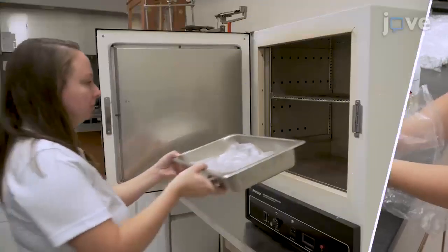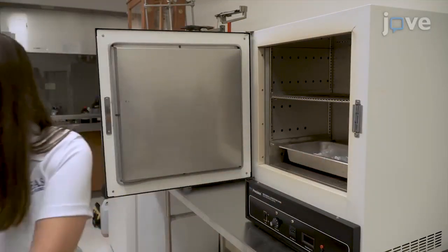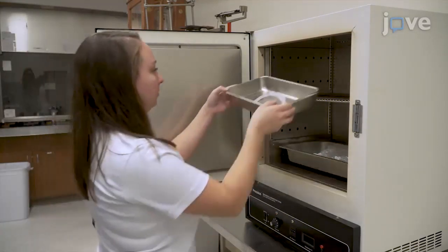Rinse all bags and tubes with 75% ethanol and let them air dry. Then bake the bags and the tubes in an oven at low heat between 74 to 85 degrees Celsius for 30 minutes.